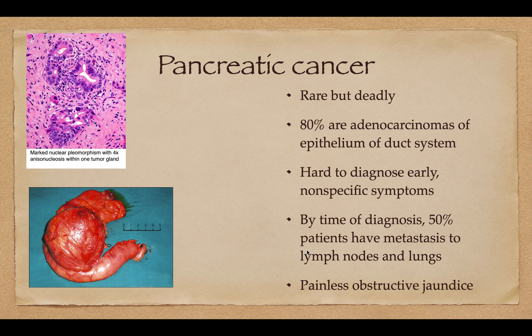It presents with painless obstructive jaundice, but by that time the pancreas is kind of shot. Here is the pleomorphism — all these cells are part of the tumor, and there's really no organization; it's just a bunch of cells.